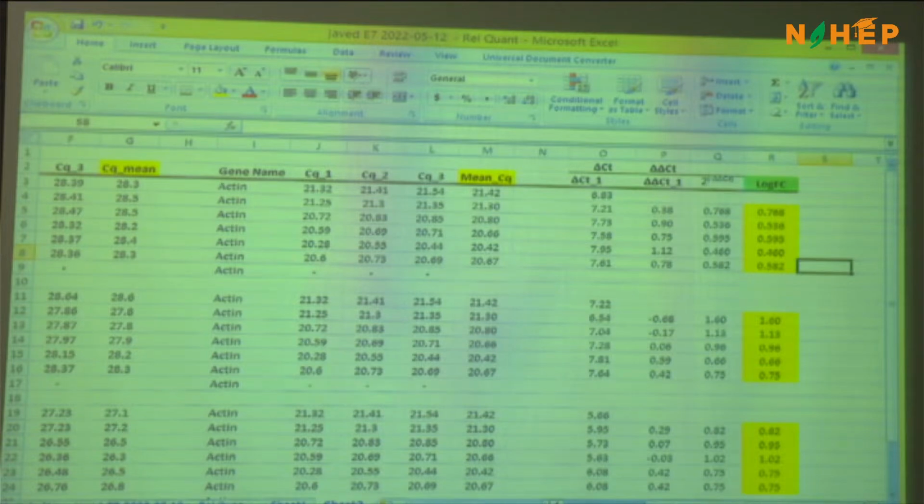You said it is 19 and 18.5. All genes are going to upregulate? No, it is lower than the reference gene. You're talking about fold change, and you're talking about a CQ value. If you're talking about CQ value, then all genes are going to upregulate. We have a standard range, but we consider it from literature and experimental design that 18 to 28 is the most probable value that comes into the expression level.